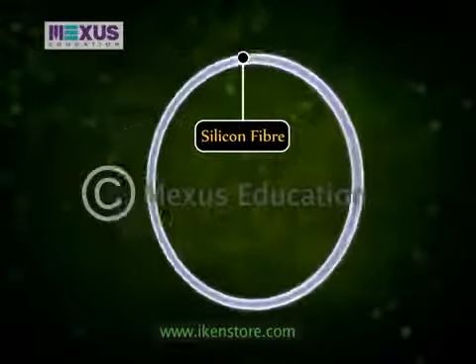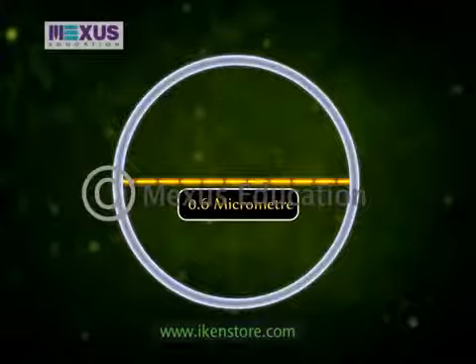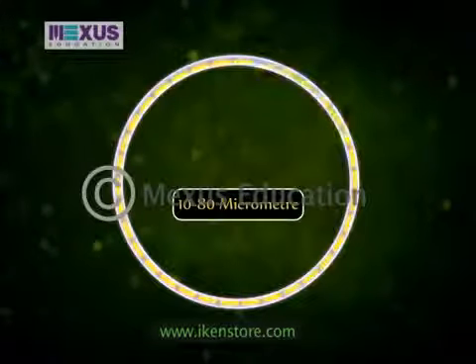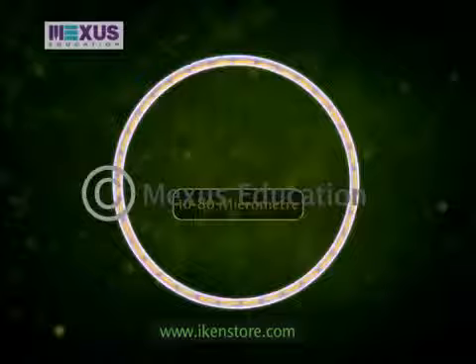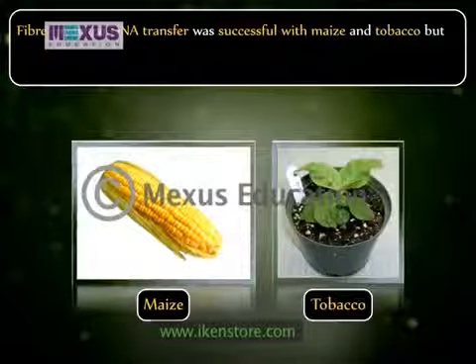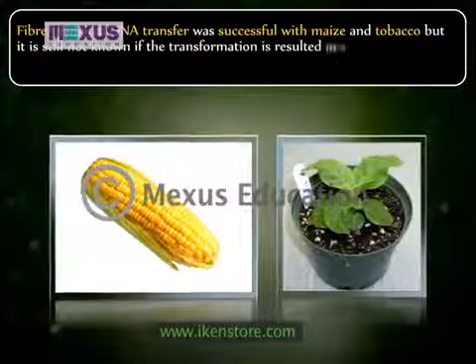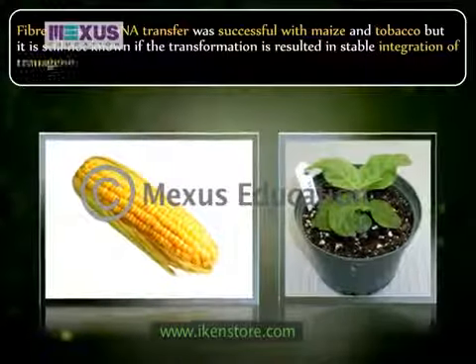The silicon carbide fibers are 0.6 micrometer in diameter and 10 to 80 micrometer in length. This method was successful with maize and tobacco, but it is still not known if the transformation resulted in stable integration of transgene.